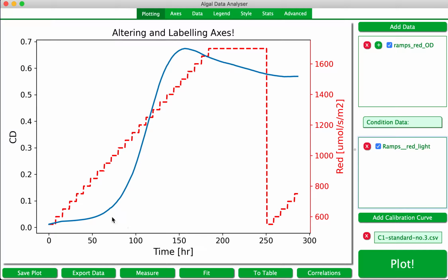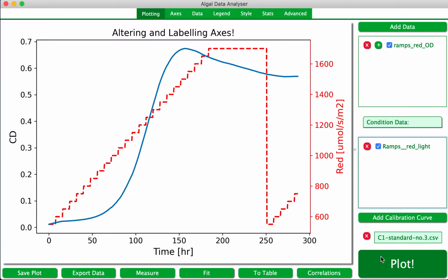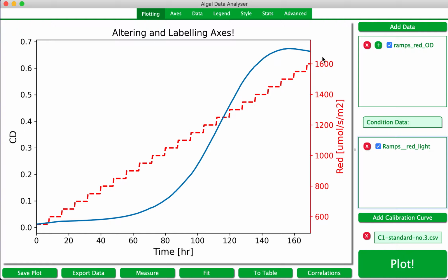If I wanted to just look at the point of the curve where, I don't know, before I hit this top bit here, I can do so. So it was about 100 and, let's do it to about 170. I can do that really easily by setting the minimum and the maximum of these units that I want it to read. So I believe it was about 170. And it will just put that part of the curve for me.